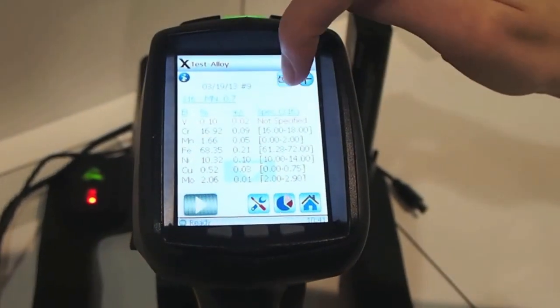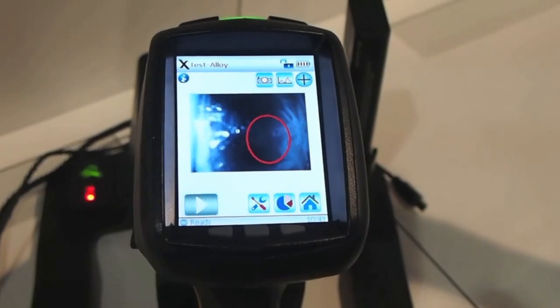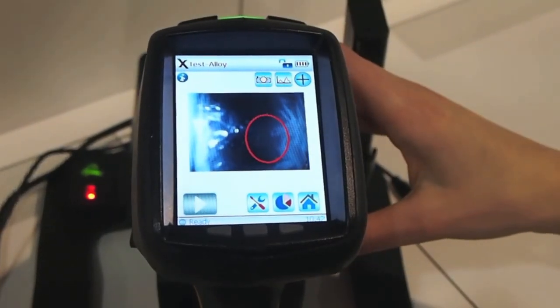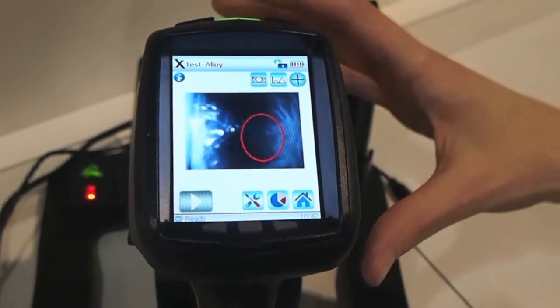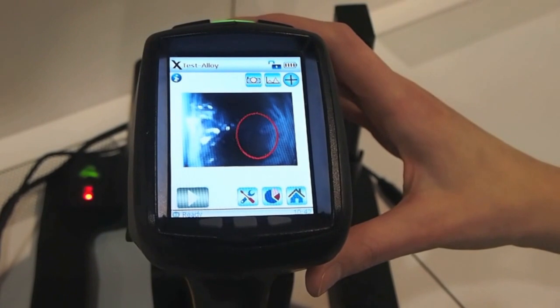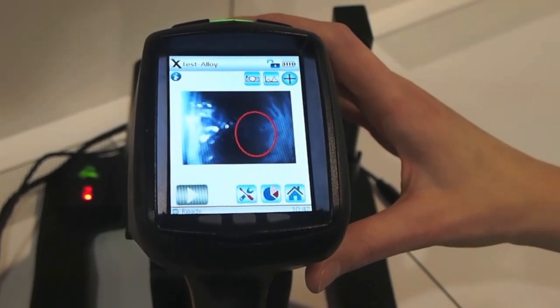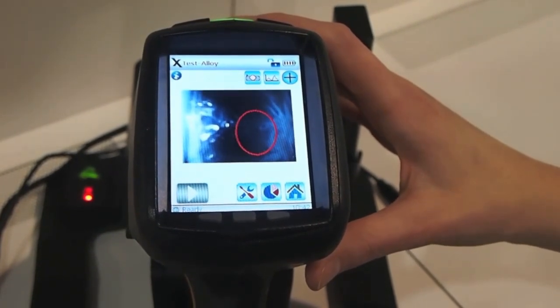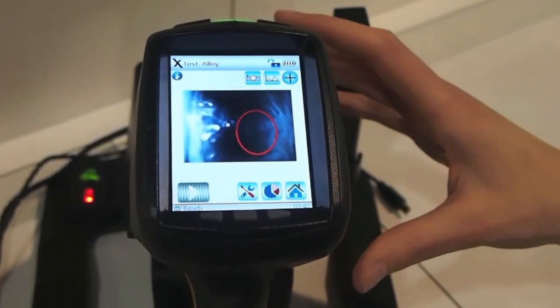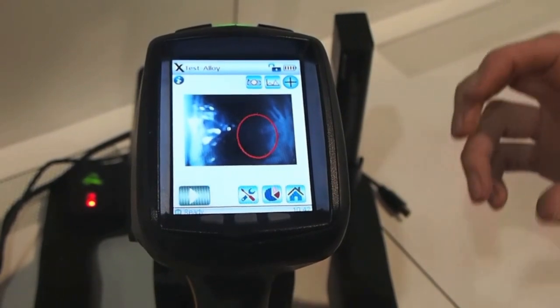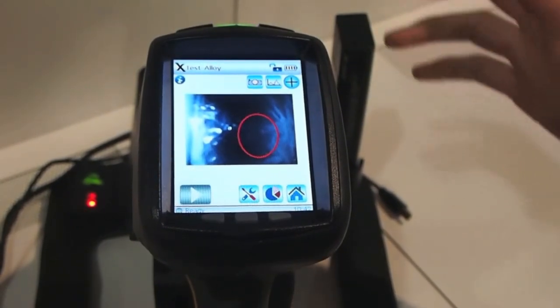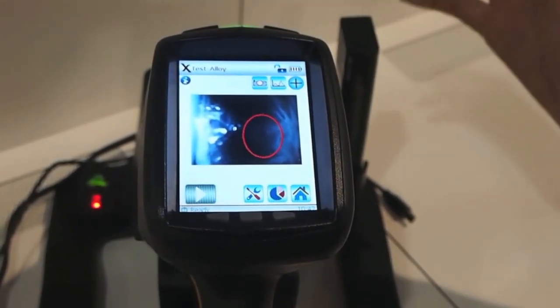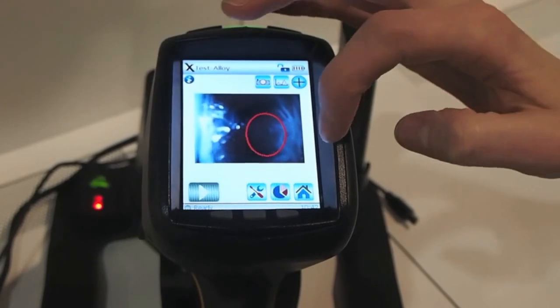Our camera feature is popular. You're able to get a clear view of the test that you're taking for the testing of small parts, welds, or consumer products that might have embellishments, rhinestones, grommets, all of that.